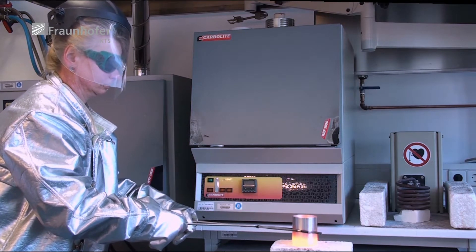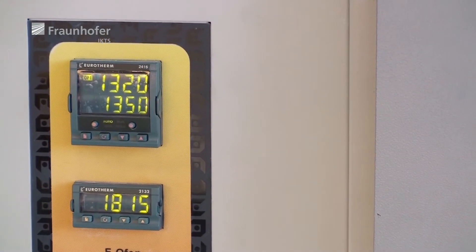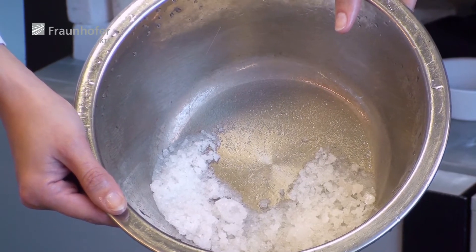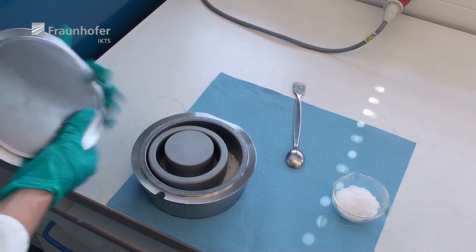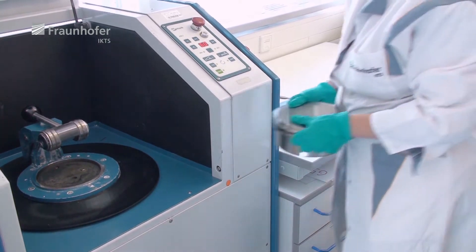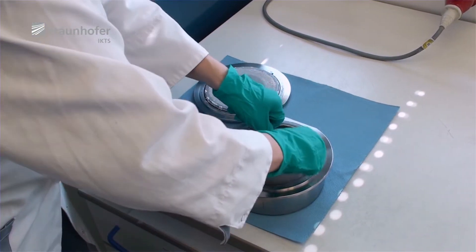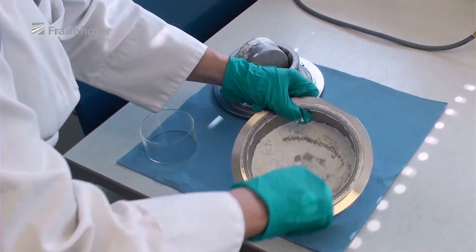For the next step, the preheated amount is transferred into a heated muffled furnace. Here the glass is melted at a designated temperature and taken from the furnace after a sufficient soaking time. The glass melt is directly fritted into cold water in order to receive the glass frit, which is dried at 130 degrees C and then pre-milled to get a coarse powder which can be processed further. All the pre-milled powder is collected and then taken to the final milling process, yielding particle diameters around 100 to 200 microns.